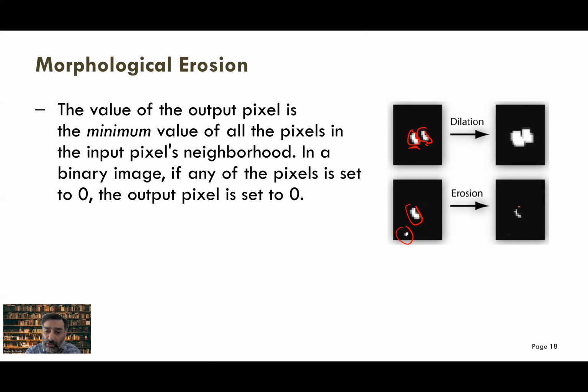And then you can again apply a dilation onto this image. And this object will look almost similar to the size before. But now, doing erosion followed by dilation, your noise is gone. So this is one of the methods to get rid of the noise in your images. And another thing, you also do the erosion to make fine boundaries around your object. Making sense? If any question, you can open up your mic and ask.